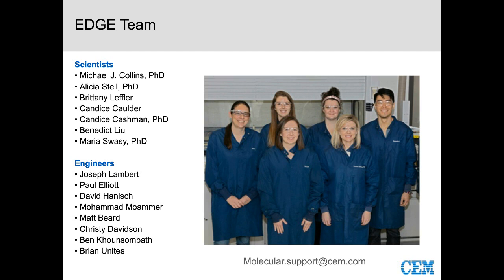How much of a liquid sample can be run on the edge? Yeah, it's a good question. So typically we'll support that liquid sample on the Q matrix Hydra, which we have run to prove that there's no PFAS contamination on that. And usually you can run about a 1-to-1 ratio of liquid to the Q matrix Hydra, and we usually recommend no more than 10 grams. So that would limit you to 10 grams of Q matrix Hydra with 10 mils of a liquid supported on that. So I would put that limit at about 10 milliliters.